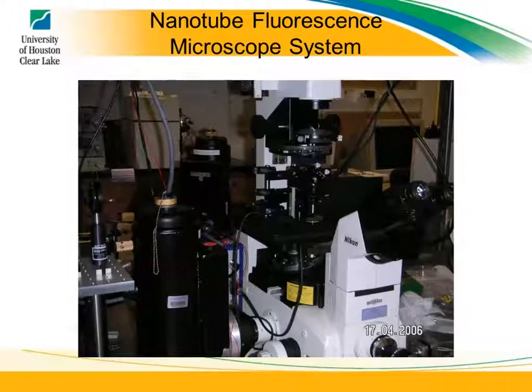That fluorescence will be captured, and you have a filter down here to block out the laser wavelength. So all you need is a long pass filter to cut out the laser wavelength. That way you can excite with a shorter wavelength, and then you can observe the fluorescence, which is a longer wavelength.